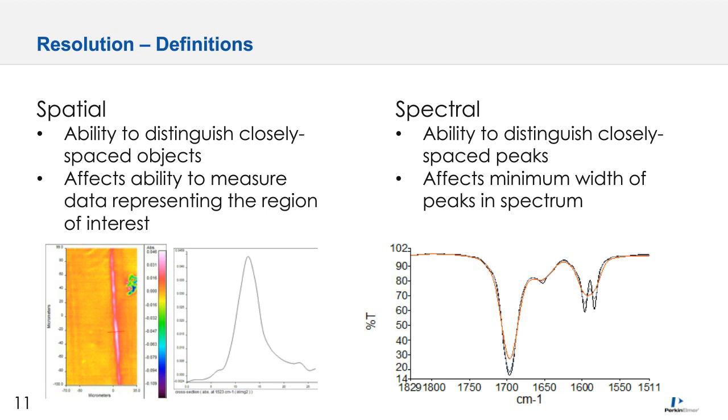Likewise, for spatial resolution, as narrower spatial resolution is achieved, there's less light reaching the detector, and also to cover the same area of the sample, a proportionally higher amount of time must be dedicated to the measurement to capture each of those individual points or positions in the stage.